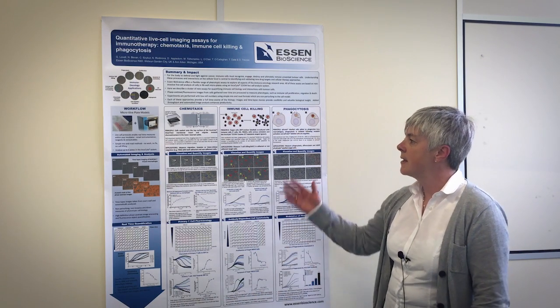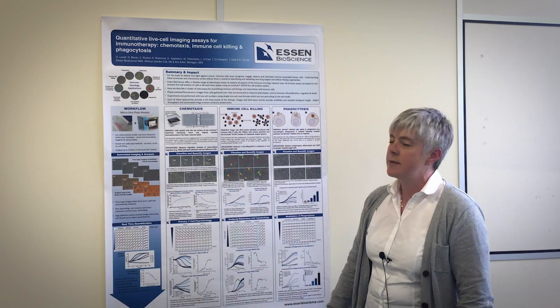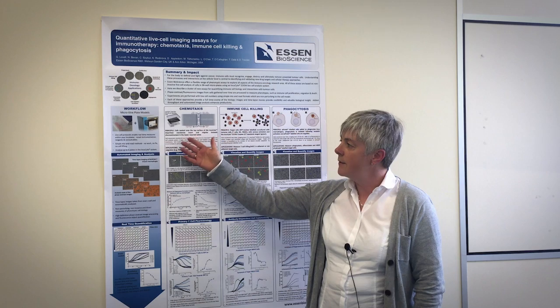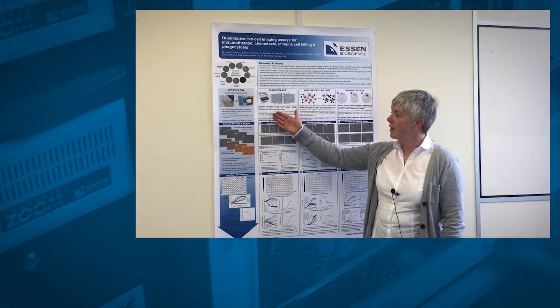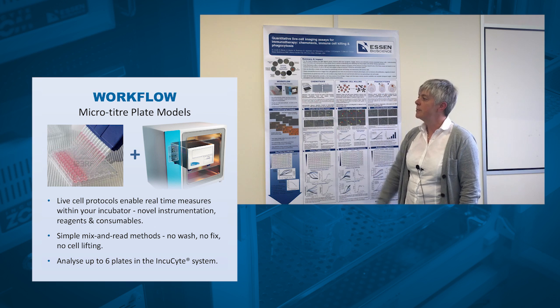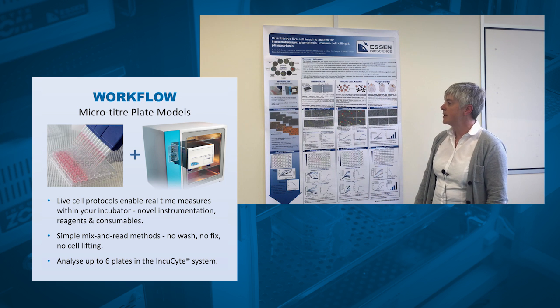All of the assays follow a similar workflow that can be seen down this side of the poster. They're all based around our instrument, the IncuCyte ZOOM, and they're all live cell assays looking at real-time measurements within the IncuCyte ZOOM machine. They are simple mix and read assays with no wash, no lifting and no fixing of the cells.